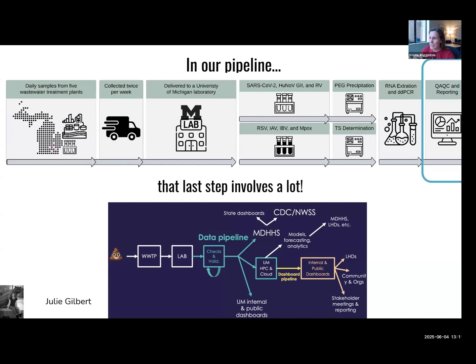And what she did is she spent hours with technicians looking at their workflow, looking at how they look at the data, looking at how they identify outliers, looking at how they rerun outliers, and then look at the data and then manipulate the data to post it. So spent a lot of time looking at that and kind of mapping it out. And then that's how she ultimately built the pipeline. So if you want to go to the next slide now.